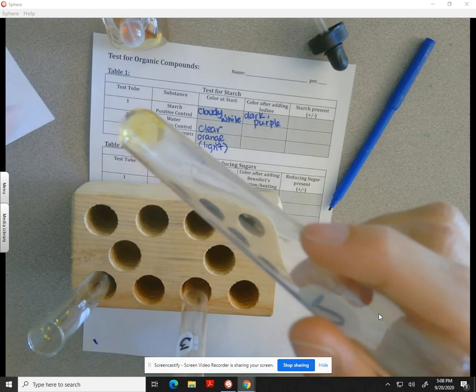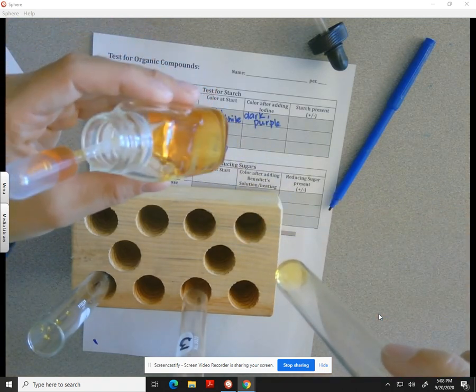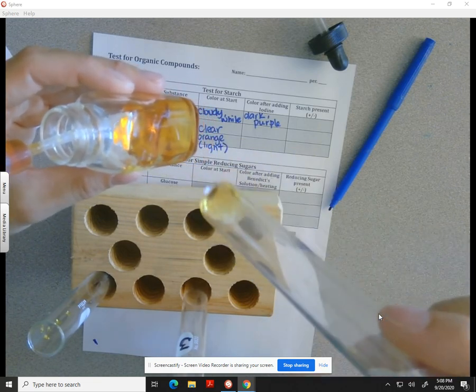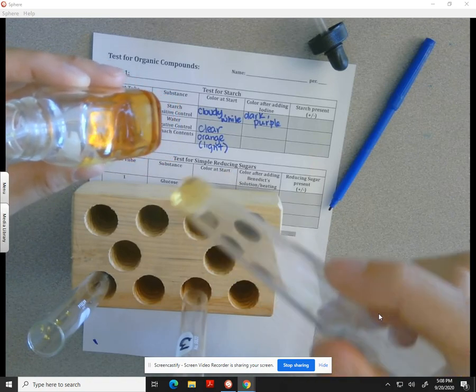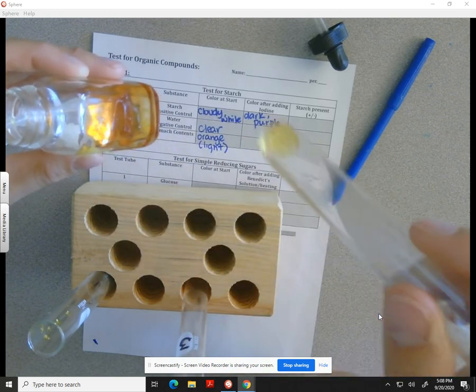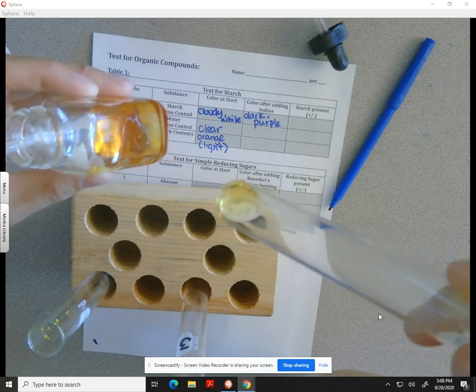if I hold up the iodine, the solution itself is this dark orangish, dark yellow color. And so I would say there was no reaction here, but simply we see a mixture now of the water mixed with the iodine, and a mixture does not indicate a chemical reaction. Remember, a mixture can just be when 2 things come together and kind of blend, whereas with a chemical reaction, we should notice a distinct change. And I don't see a big change here.